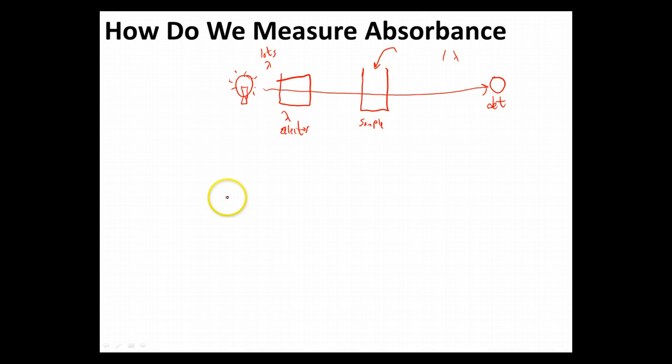And if we put in water, or whatever our solvent is going to be, so it's everything that we have that we need except for my actual sample molecules. We're going to have that sitting in the cuvette. So it's solvent and cuvette and probably some dirt and everything else, in other words, except for my sample. We're going to do a measurement of that stuff.